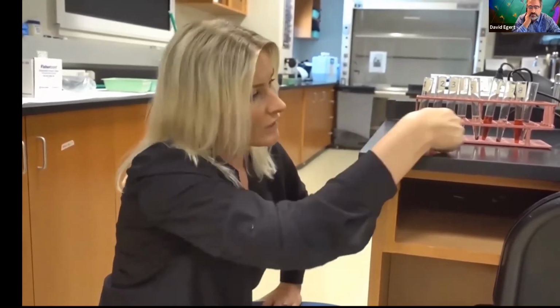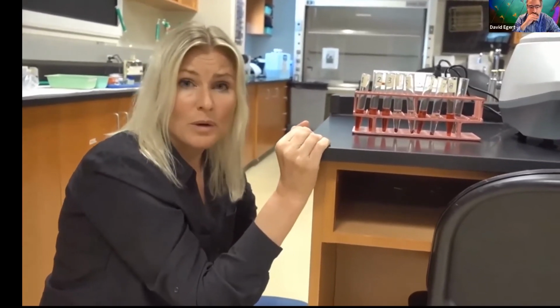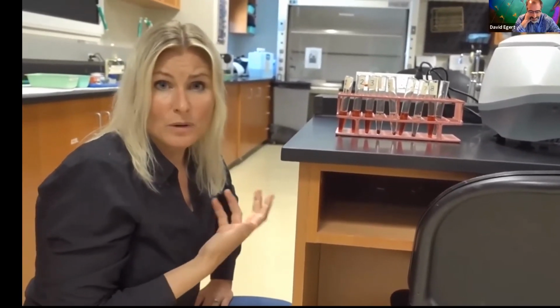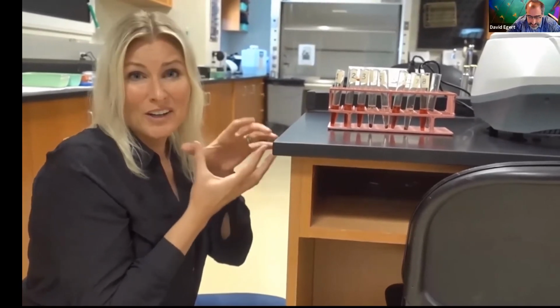We're going to have to take a look at some of these pellets under the microscope to actually figure out if they crenated or if they're just the same as they were before. Because remember, they get pink when the cells actually lyse and we get the hemoglobin out there. But when they crenate or they stay the same as they were from the beginning, that's not going to be indicated by your supernatant. And so in those cases, we most certainly should break out the microscope and see if they're actually swelled up, or sorry, shrunken up, or are the same. All right, we'll come back in a few.